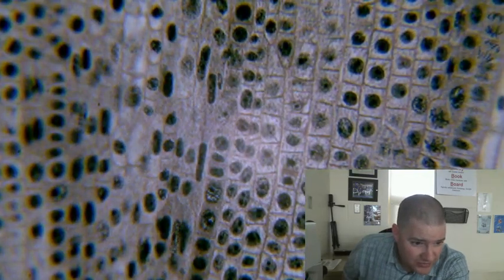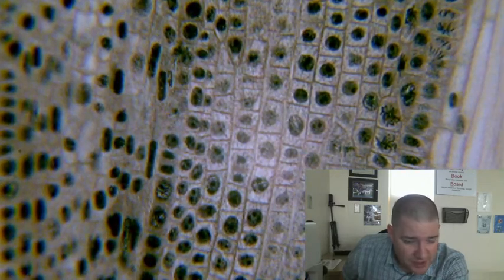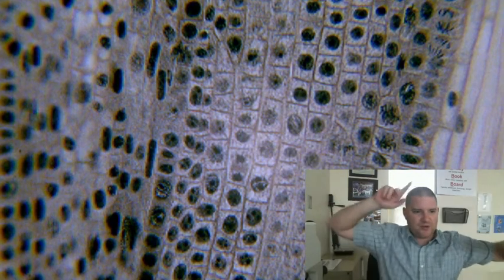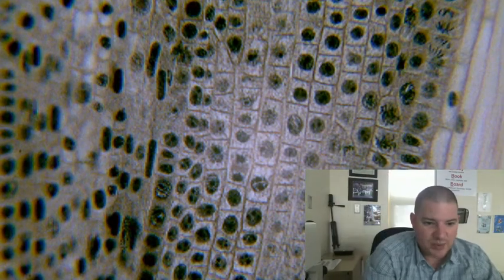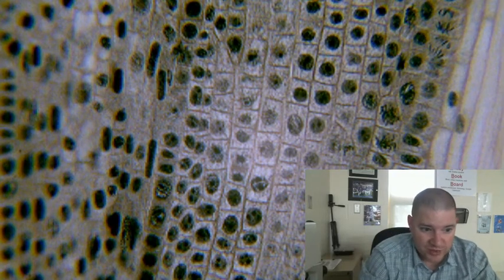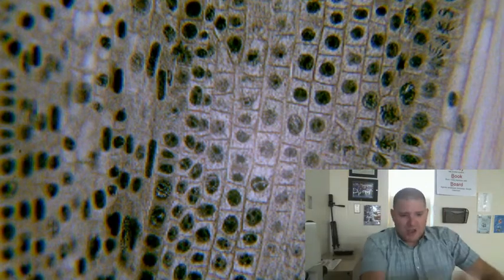We see a lot of interphase happening, but you are able to see up in the top, this corner, I guess it would be your top right corner, right above me almost, all the way up. You can see a couple of cells going through anaphase because they are separating apart. They're going from opposite sides there. So there's a good picture of an anaphase.